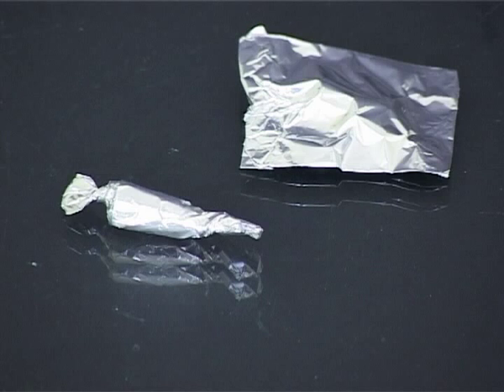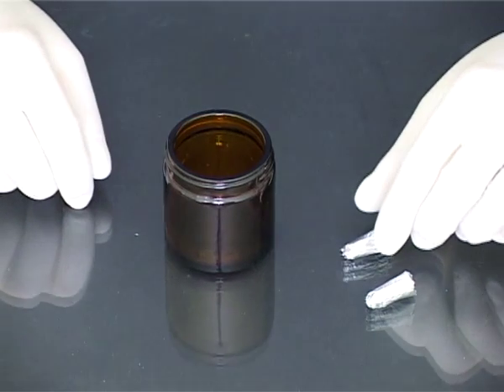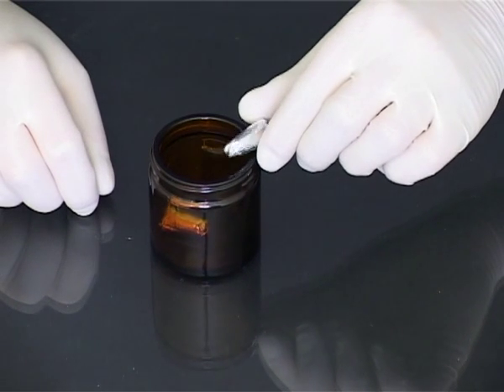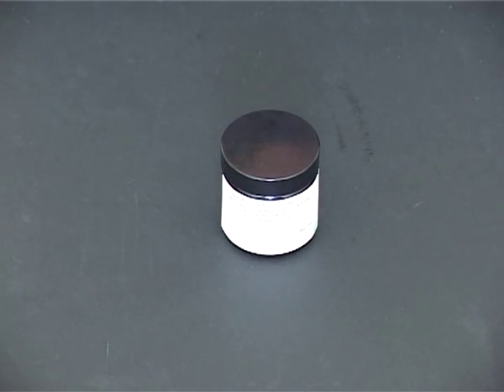These are examples of poorly wrapped suppositories. Once wrapped in foil, transfer the suppositories to an amber glass jar and label.